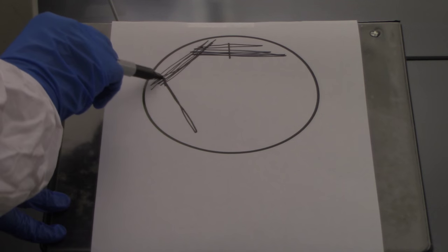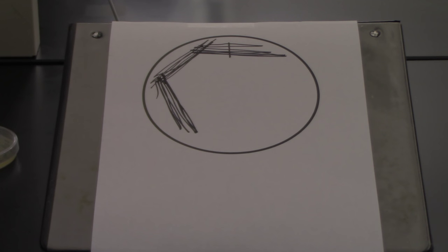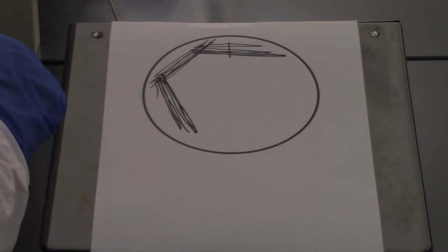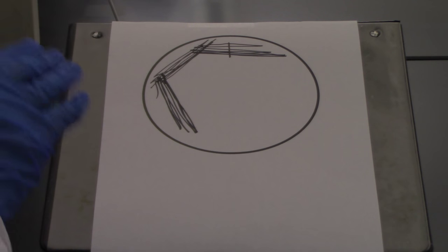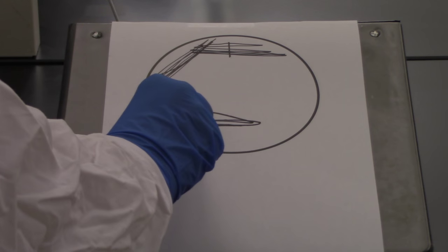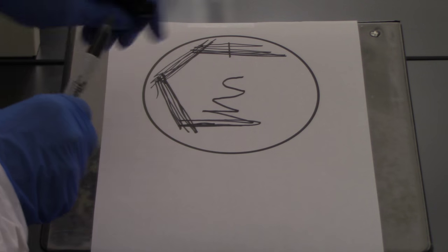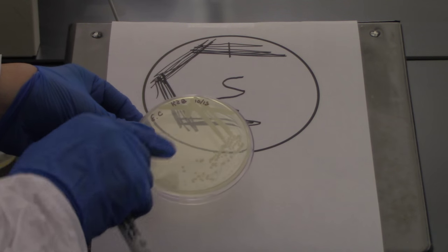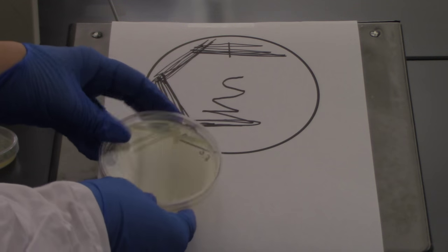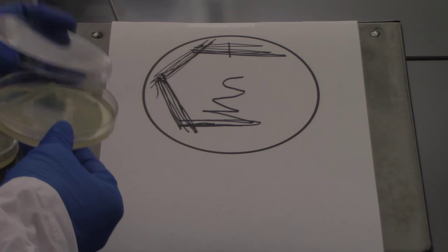I'm thinning out what I have, going back through several times, then sterilize my tool again and let it cool. I'm going to do my fourth and last zigzag, spreading it out to thin out the bacteria. As I go through the middle I'm going to really spread that out, not touching any of my other zigzags. My goal is that as I move out to this last portion, I can get those bacteria spread out and by themselves so I can pick up an individual colony.